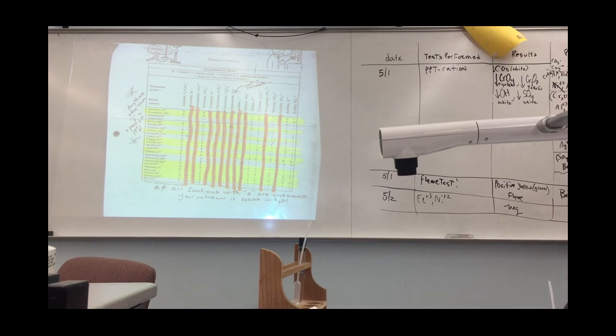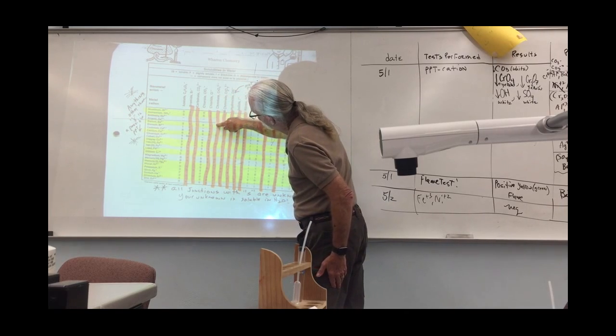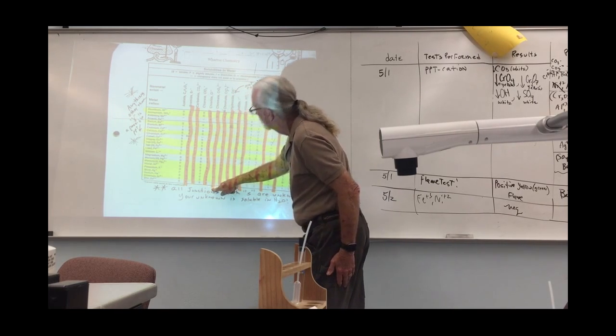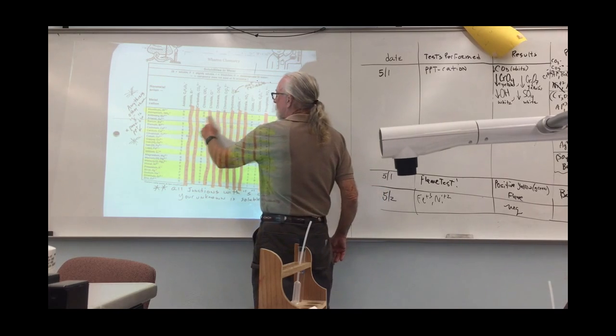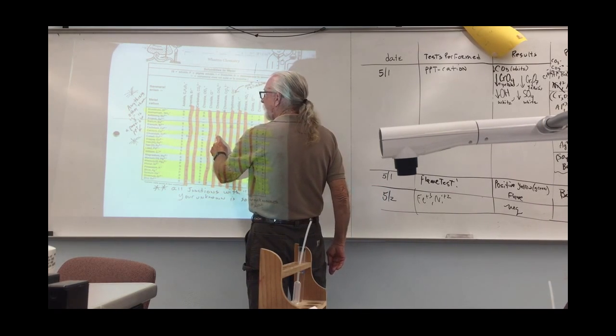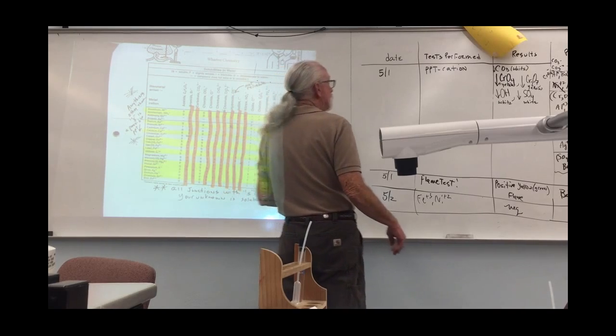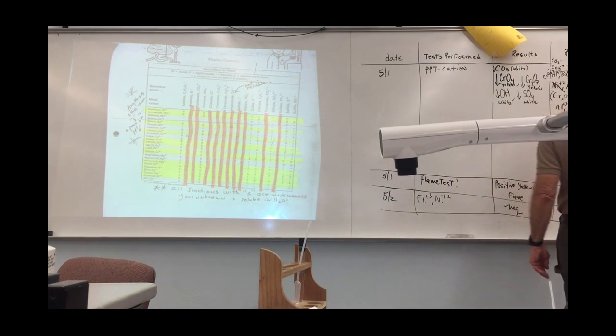Then I go to chromate. I look at chromate. I write down all the ones here that react with chromate. Barium, yes. Calcium. Oh, look, we eliminated calcium. So calcium's not my unknown. So you'll notice this list here doesn't contain calcium, so I eliminated it.